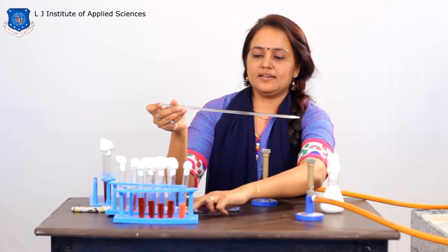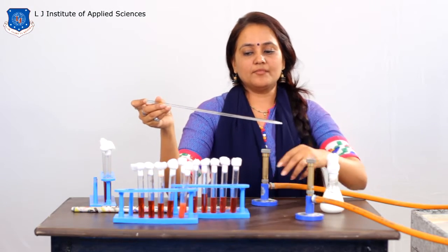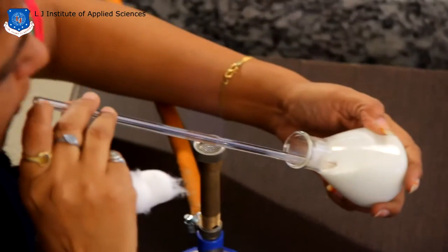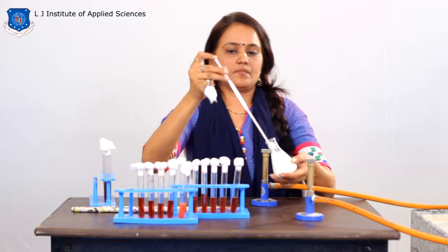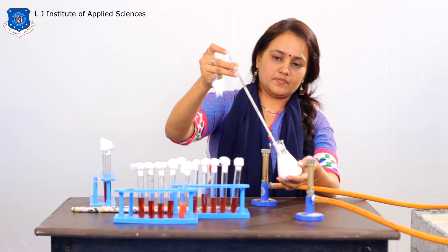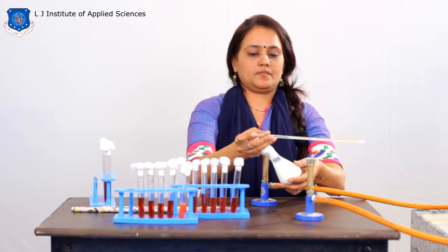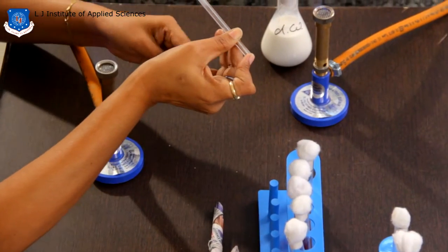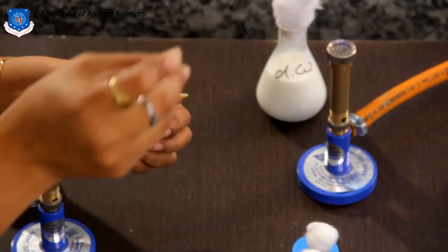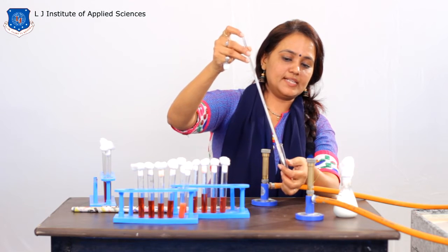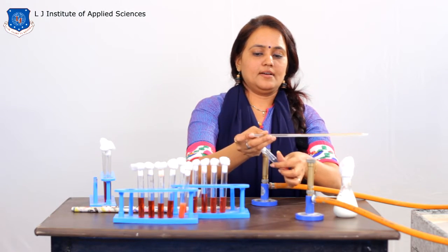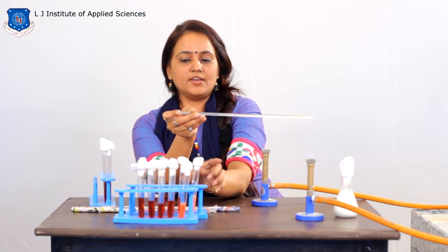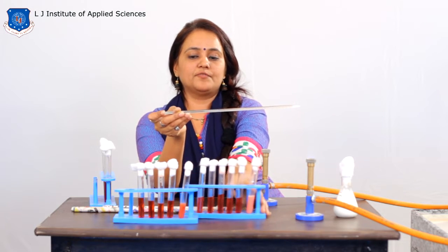In the second portion — these 5 test tubes — I am going to inoculate 1 ml sample. This is 1x 5 ml MLBB, inoculated with 1 ml sample. Mix it properly and go for incubation. Same way, you have to inoculate 1 ml in all 5 test tubes.